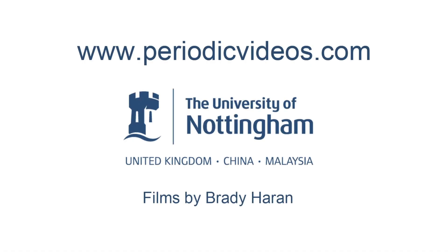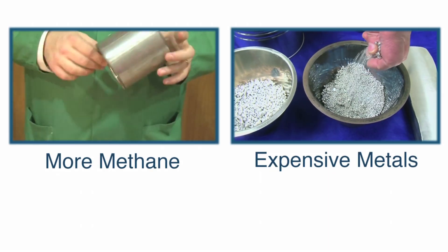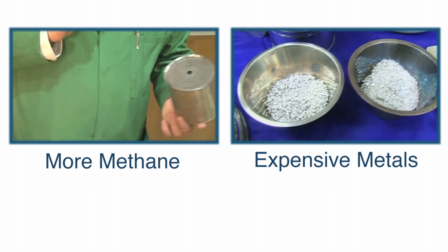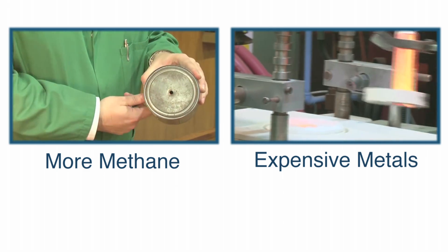What we're going to do now is investigate an explosive mixture of methane and air using this very crude device — it's simply a can that Neil and I have doctored slightly by drilling a couple of holes, one in the bottom and one in the top.